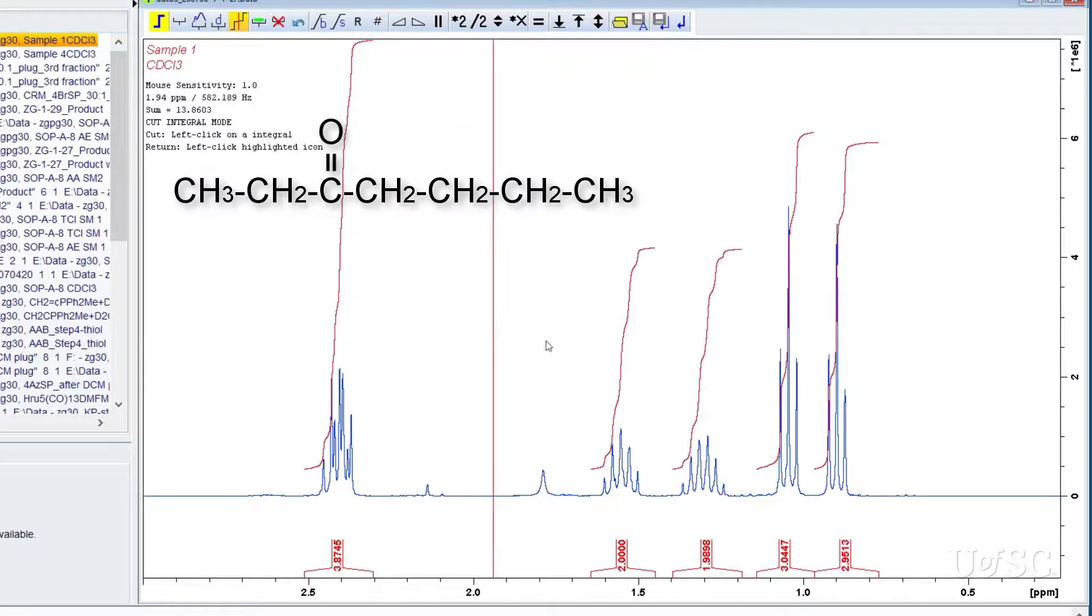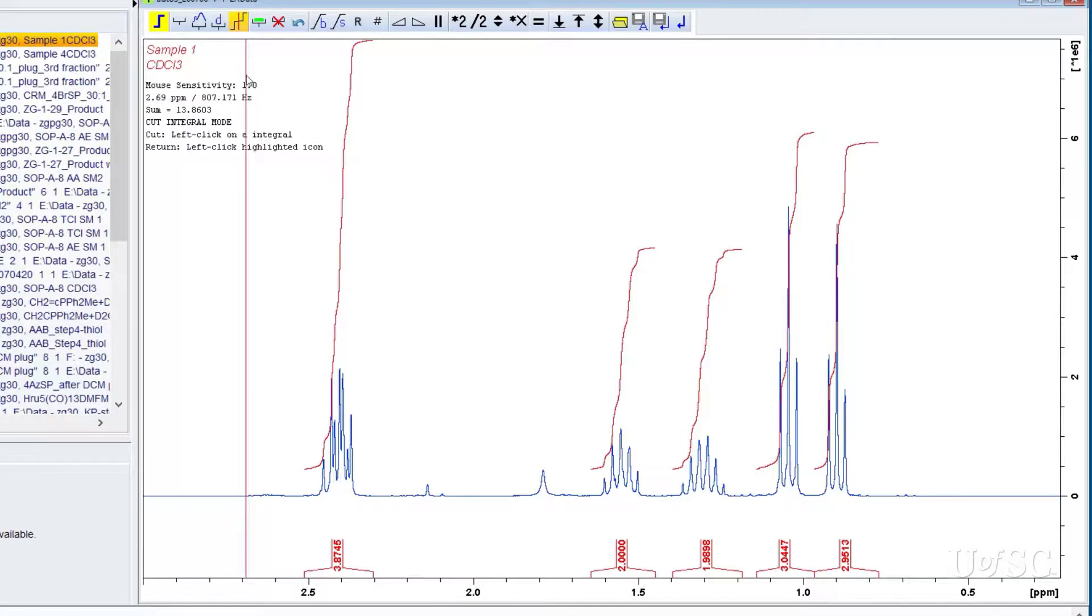Here we can see that there are 2 methyl resonances, 2 methylene, and an area with 4 protons. This is a spectrum of 3-heptanone and the 2 methylenes adjacent to the carbonyl have similar chemical shifts and are in this region.